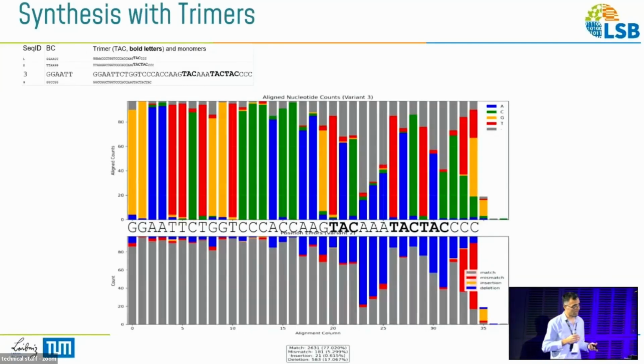And also this one, as you see, we have so much error when we are using 2 trimers consequentially separated from another one. As you see here, we have a lot of errors, and this sequence didn't work very well, which we are working on to make it work.